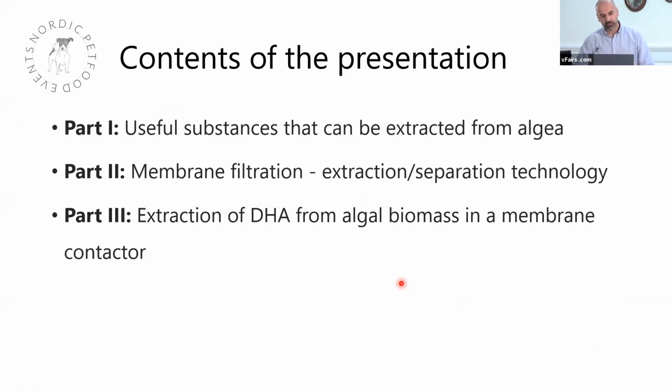Presentation is divided into three parts. In the first part, I'll talk about useful substances that can be extracted from algae. In the second part, I'll explain a little bit about membrane filtration, which is a technology we are suggesting for using in this extraction process.